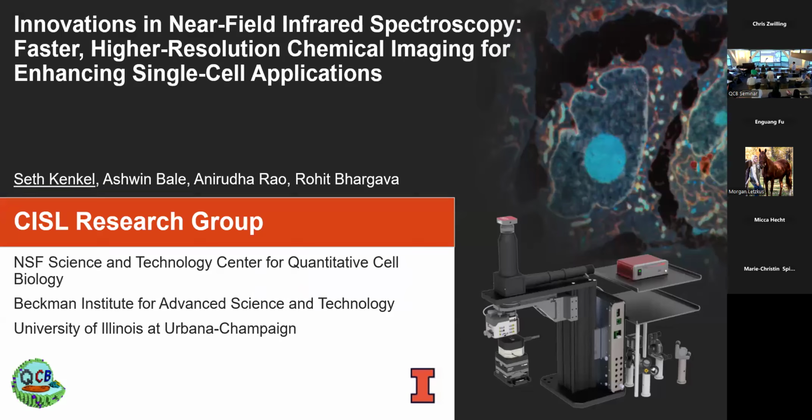This is an image from the original system, the PNAS work in 2022. You can see the registration is fairly decent down to like the 40 nanometer pixels. And I'll show an image later in the talk of what these look like before the registration, because over 3 hours of imaging each band, they do thermally drift quite a bit, almost hundreds of nanometers.